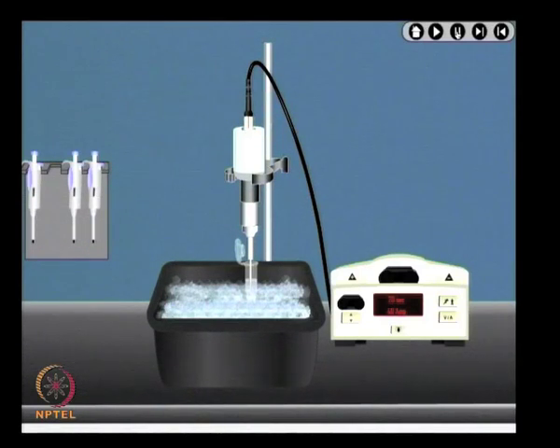Resuspend the pellet with protease inhibitors and lysozyme, and cells can be further ruptured by sonication on ice to prevent foaming and heat. The sonication step helps to release the contents of bacterial cells.